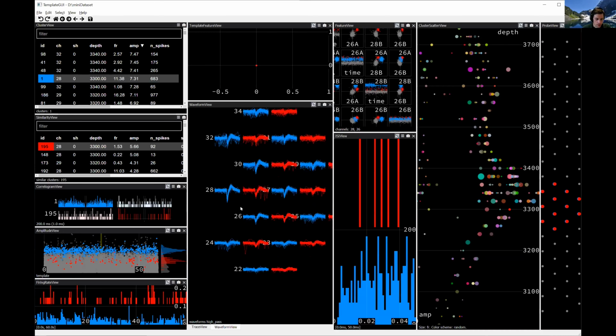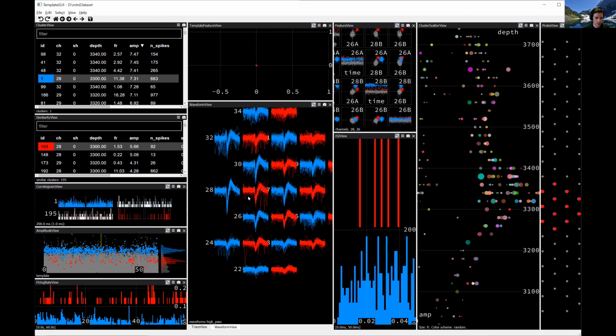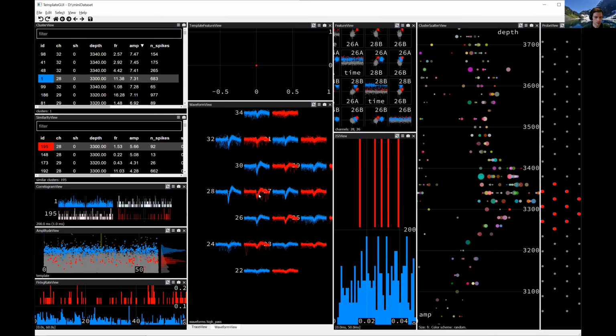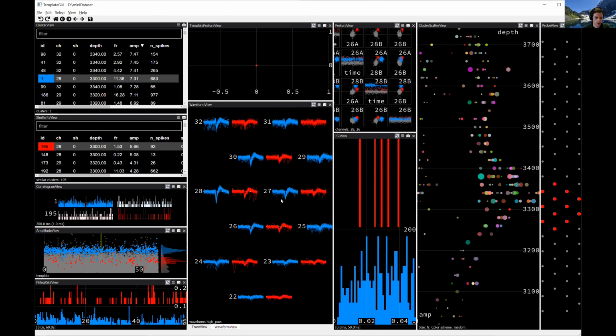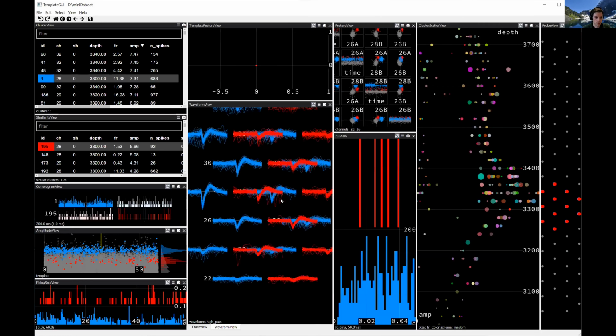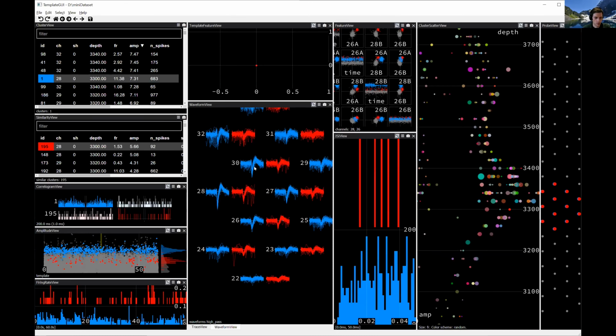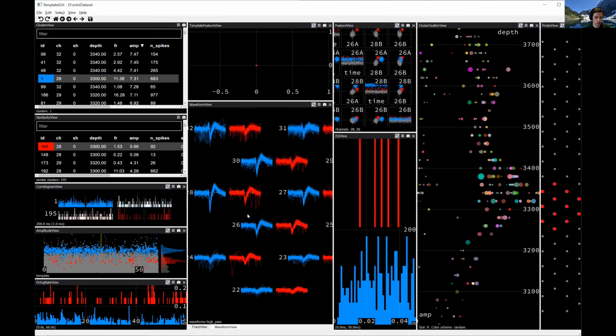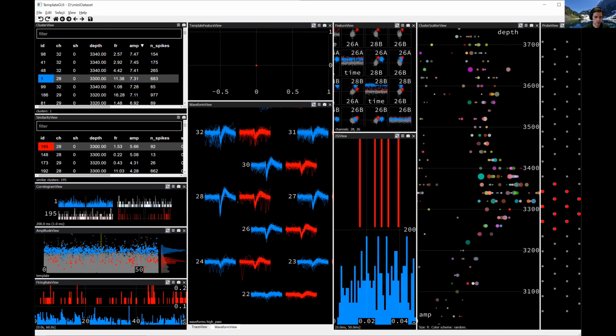Okay, and you can do a couple things with this view. One is you can scale. Here I'm holding control and moving the scroll wheel up and down. If I hold Shift, nope, that one's not working for me. Not sure why. Okay, if I hold shift and do arrow keys, I can move these apart that way. Control arrow keys, I can move this way. Okay, so there's a few different mouse things to zoom in and out. You can also right click and zoom around. So that can give you, making sure you have the best view of the waveforms.